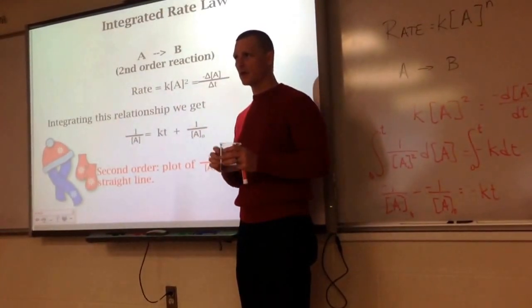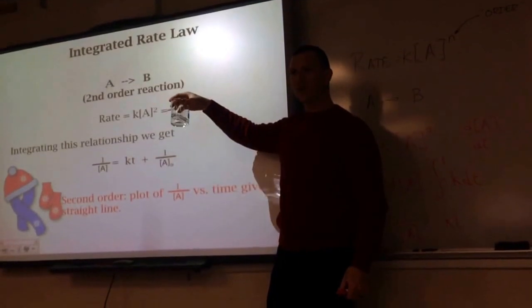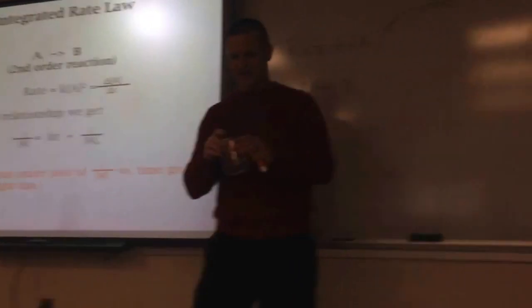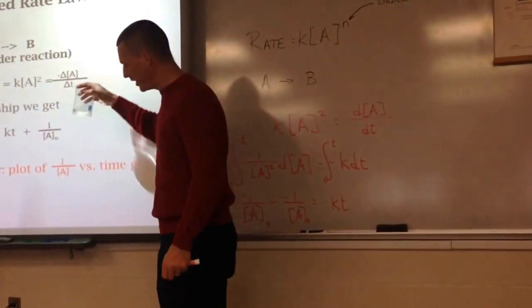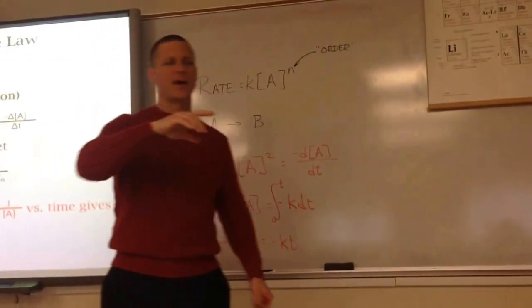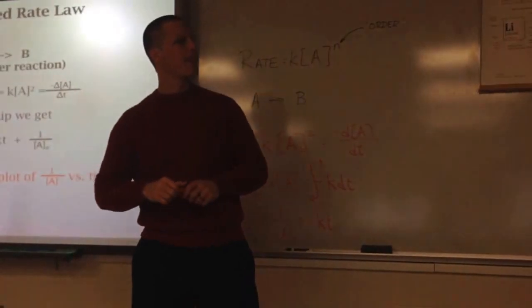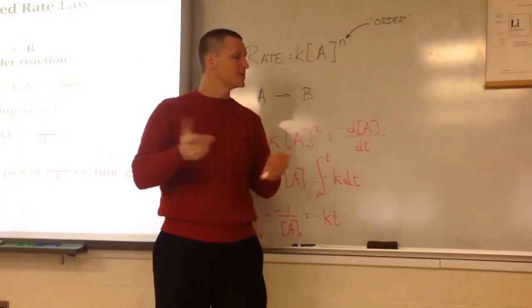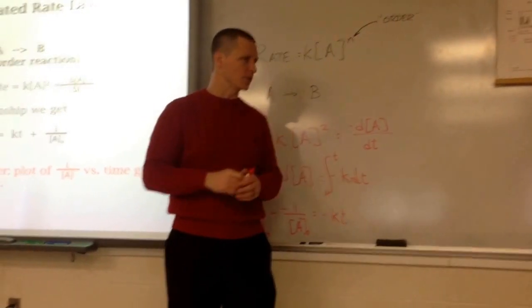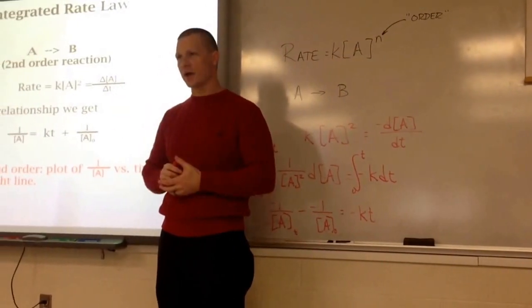Remember our food coloring? This is it. You see how the concentration of food coloring is changing. That will continue to change, not by much, but it'll get a little bit lighter over time. You're only monitoring in the lab tomorrow for like 3 minutes. It won't absorb as much light. The darker it is, the more absorption. A is the concentration of the reactant.